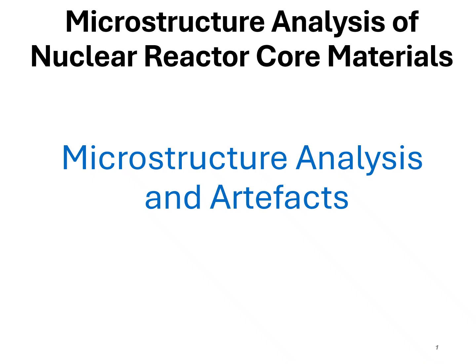Out of some lectures on TEM examination of nuclear reactor core materials, I want to have another presentation here, which is going to focus on the interpretation of images and the effect of artifacts, basically mistakes that one can make when examining materials using the TEM.